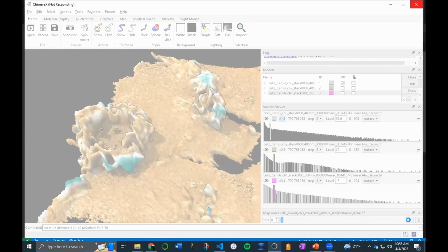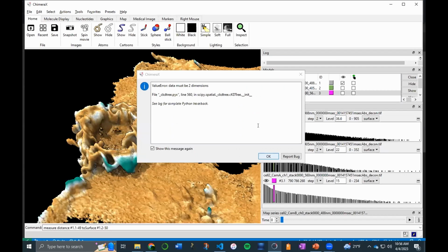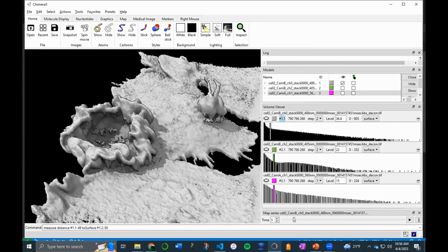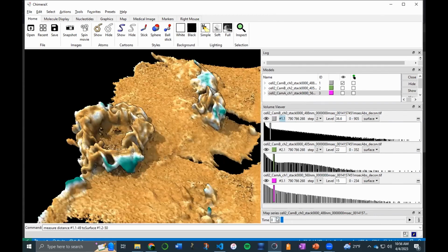And so my apologies in terms of loading all the data in first. There's an order of operations that we need to use, and if you don't, well, you suffer this pain. But yeah, this is just some of how people interact with it: these very simple commands of say, measure something, right? Do something. And the user guide for this is going to be kind of your best friend in all of these things.